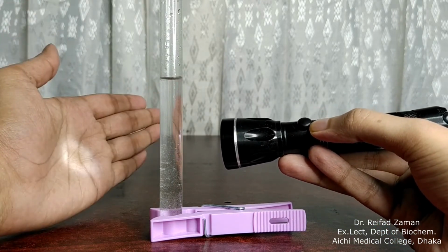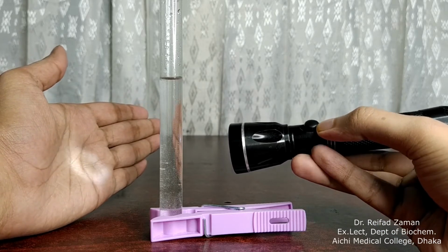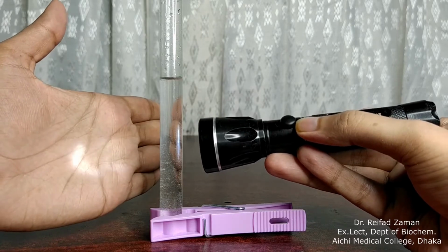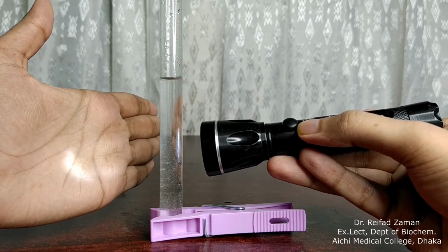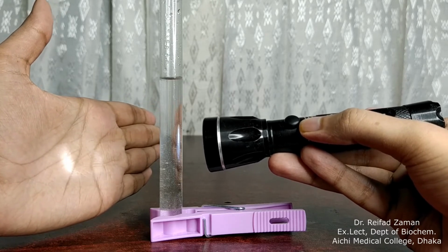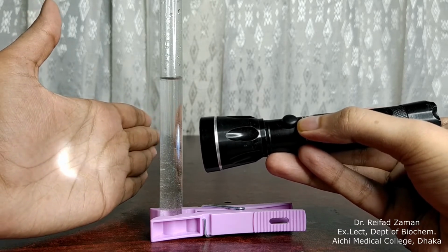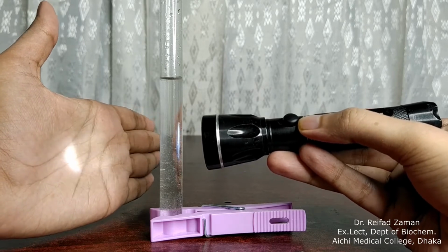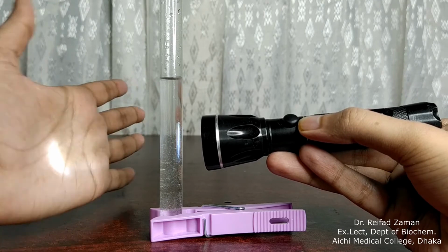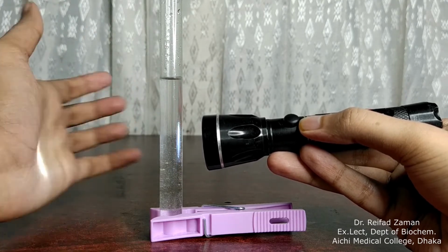You can see if I pass on light through it, lightটা এটার এক সাইড দিয়ে গিয়ে জাস্ট অপোজিট সাইডে আমার হাতের উপর এসে পড়তেছে, and ভিতর থেকে কিন্তু খুব একটা রিফ্লেকশন হচ্ছে না. কিছুটা রিফ্লেক্ট হচ্ছে এটা ভিতরে গ্যাস বাবলের জন্য, but ideally there will not be any reflection. It will directly pass through and fall on the other side of your hand, like on this hand.